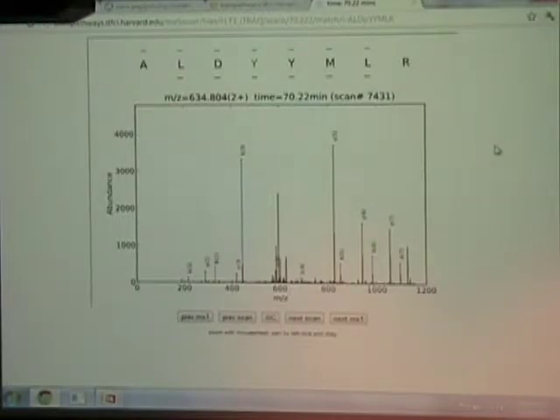One aspect which most data resources that allow you to look at raw data don't currently do is allow you to interactively look at the MS1 data. This is very important for quantitative work and for looking at whether there's some impurity in the data. You want to look at the precursor ion. And again, I'm sorry if I'm getting into mass spec specific stuff, but for people who do this, it's currently very difficult to communicate that level of data short of giving people the raw file.